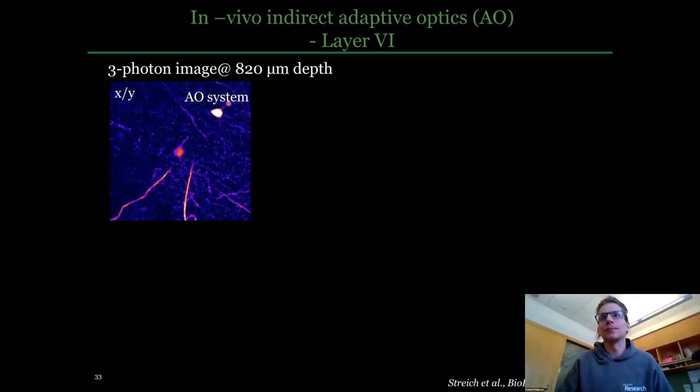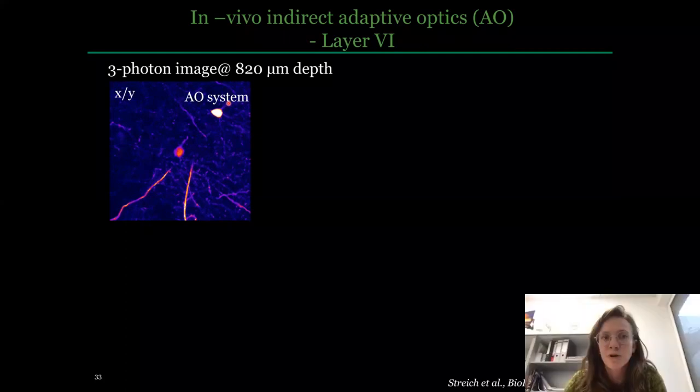Understood. Thank you. But you could also focus on one spot, and then you would be limited by the update rate of your deformable mirror. Yeah.